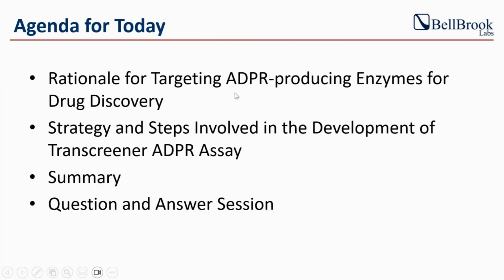This is the agenda for today. First, I will talk about ADPR producing enzymes and how they are important for drug discovery. Then I'm going to talk about how we developed the Transcreener ADPR assay and how we applied it to the specific case of CD38 and PARG. Finally, I'm going to address any questions you have. If you have any questions during the webinar, please type them in the Q&A and we will address them all at the end of the presentation. All right, let's dive into the first part.